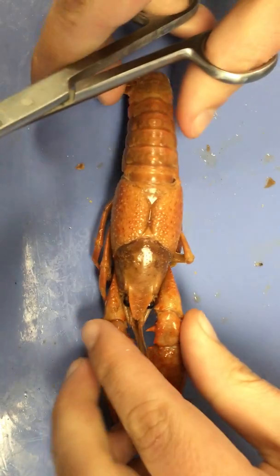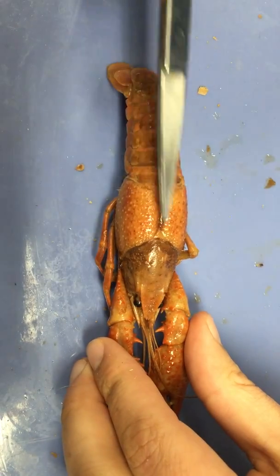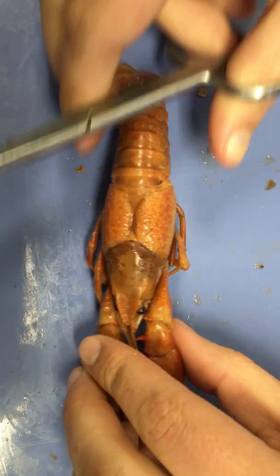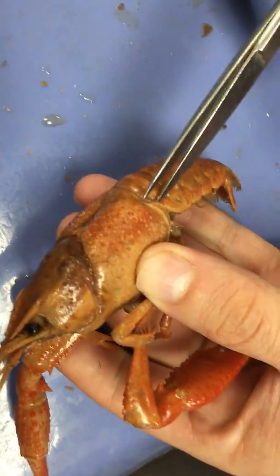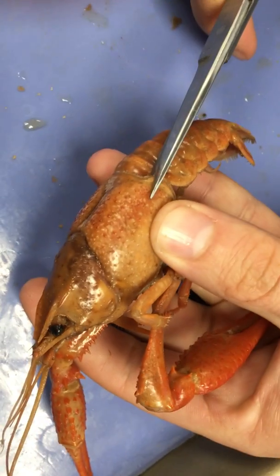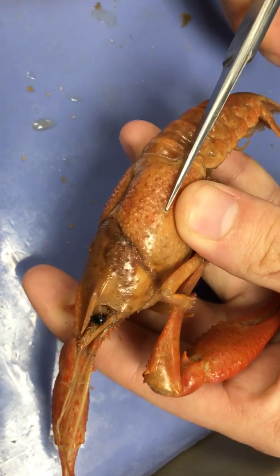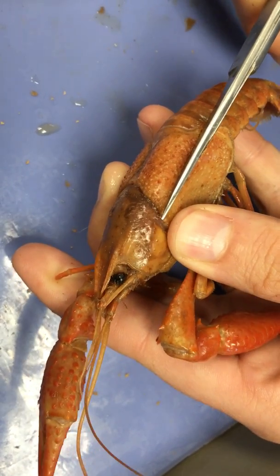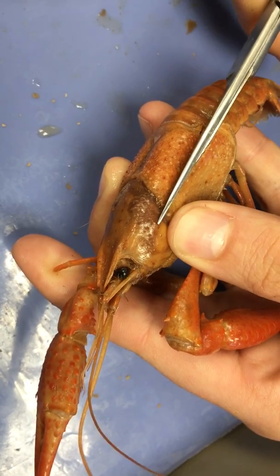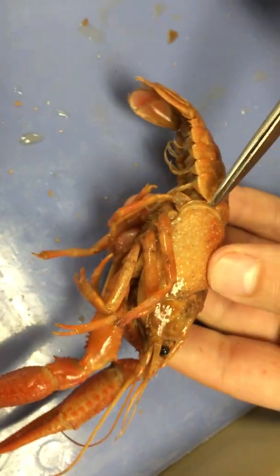First, to access the internal anatomy, we're going to make a series of cuts so that we can open up the top of the cephalothorax. Starting at the side, get just underneath the cephalothorax and then lined up with the eye, you cut right to the eye line. Make sure you hug the scissors just underneath the exoskeleton so you don't damage the internal organs. Cut up to the eye, and we're going to repeat this process on the other side.